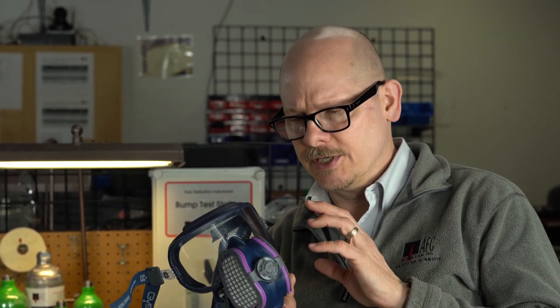This is Jim Sinesco for AFC International and we just got our Integra in just for the day or two to show you. We don't have them in stock yet, but I do want to give you some features and benefits of the Integra.